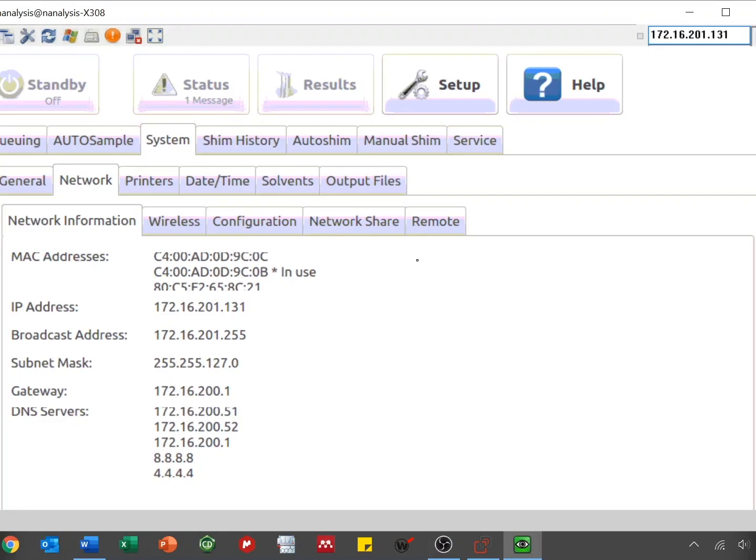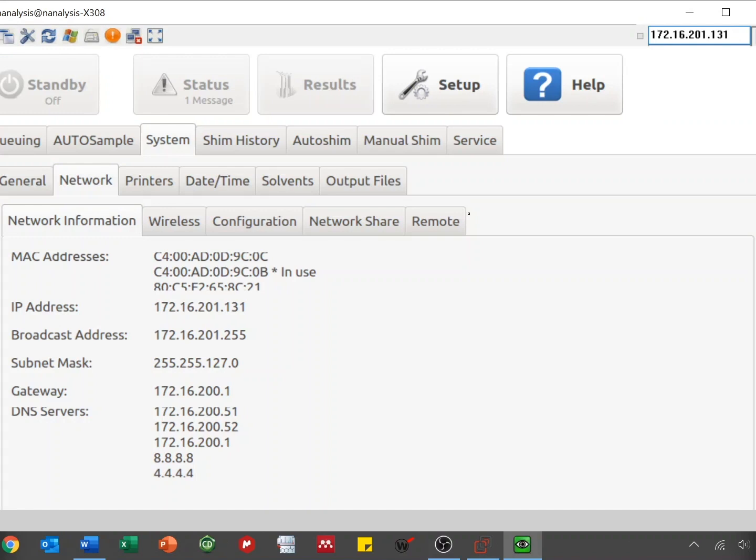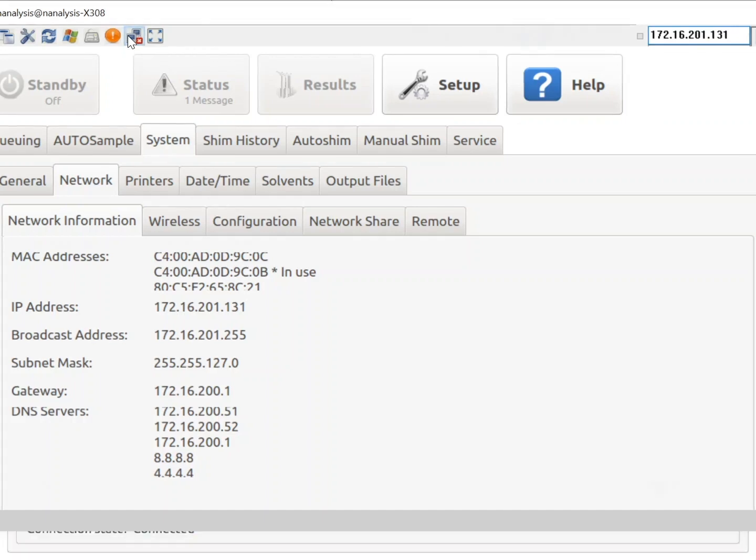At this time, you'll be able to view and control the spectrometer's screen. You can now control the instrument as you normally would. Once you are done, simply click the Close Connection button within UltraVNC to terminate the connection.